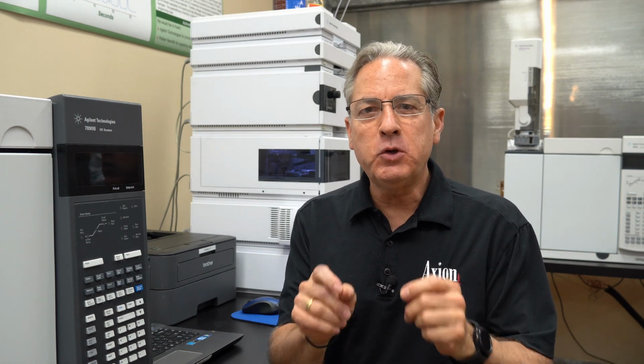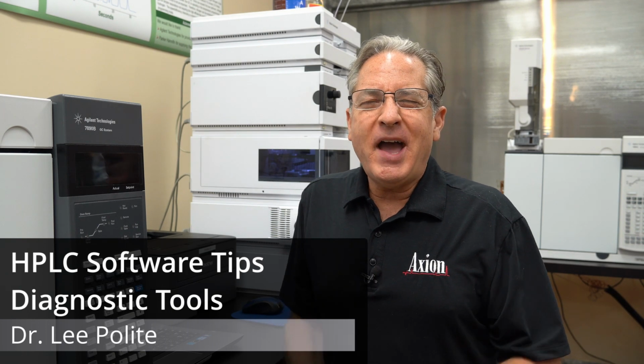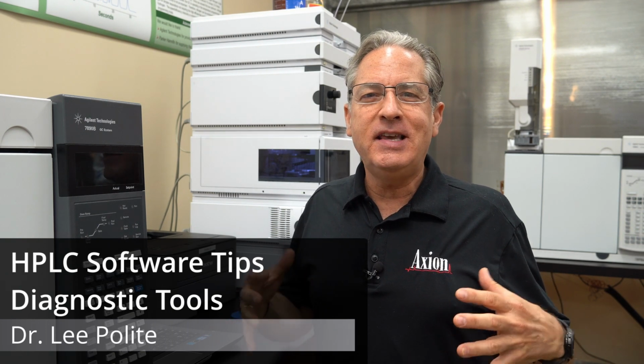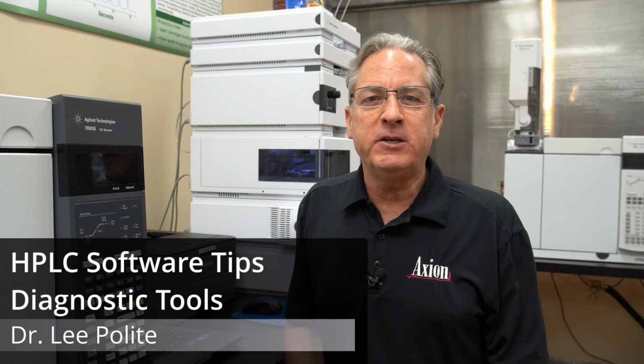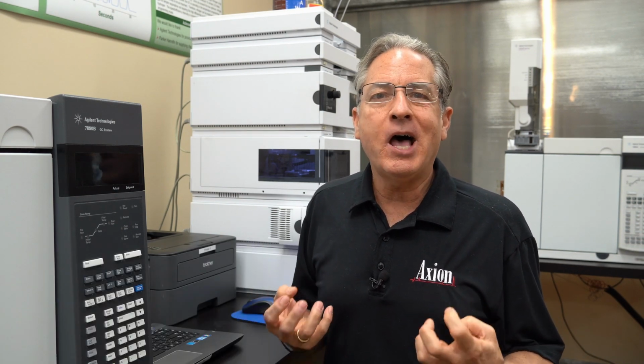So let's talk about troubleshooting of HPLC. And to do that, we'll use some specific questions that have come in recently into our lab. I categorize a lot of these as, is my LC okay? Is my HPLC working? Let me show you some of the built-in diagnostic tools that will help us come to the answer to that question.